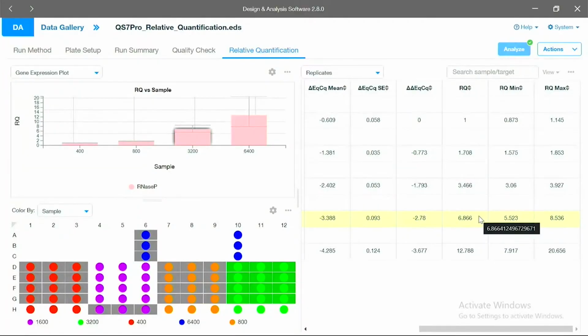Again, the hard part's actually getting the information into the software, not necessarily getting plots out of the software. And honestly, the most physically demanding is setting up the plates. But is it really that hard? And you can always ask Molly to do it for you.